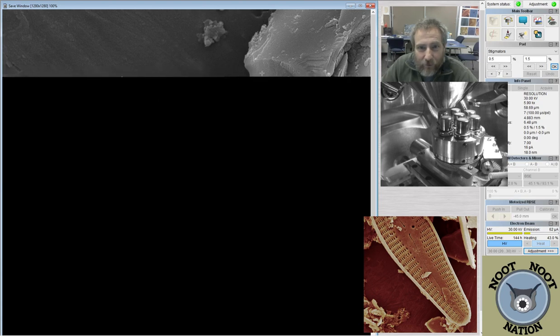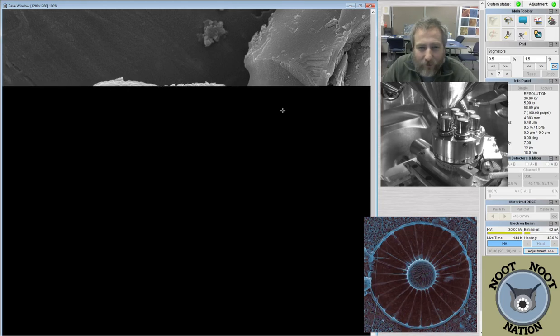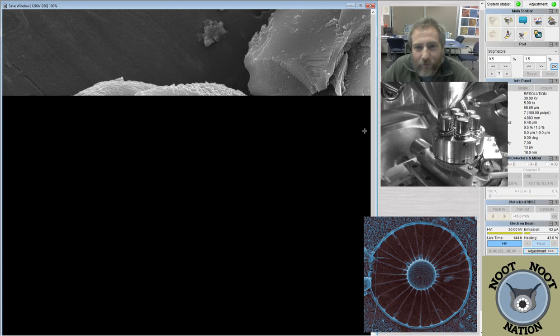So this large bouldered thing here is a sand grain or a silt grain. It's probably still in the silt size fraction. But you can see it's quartz.